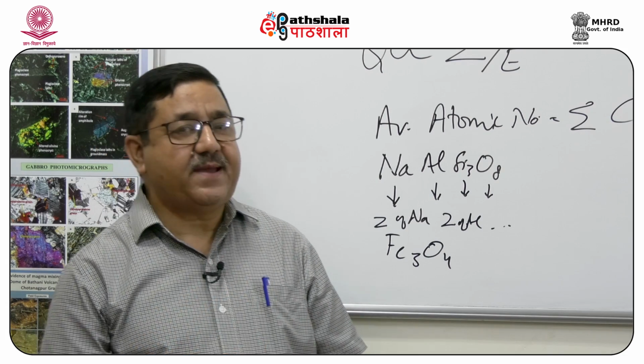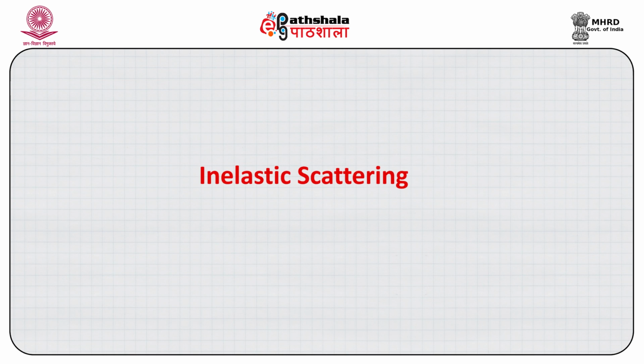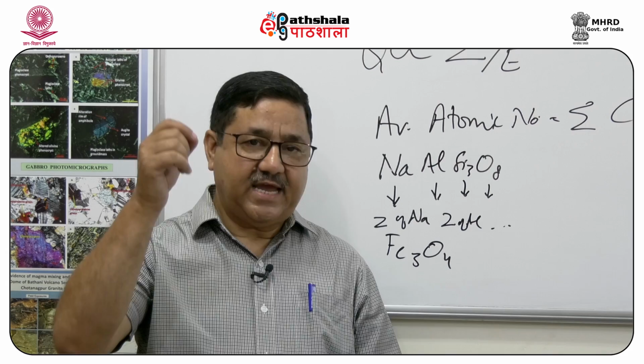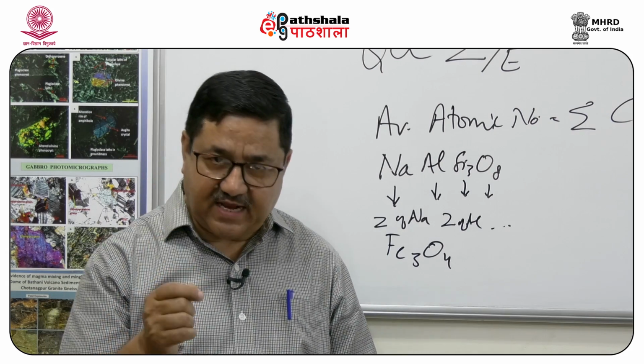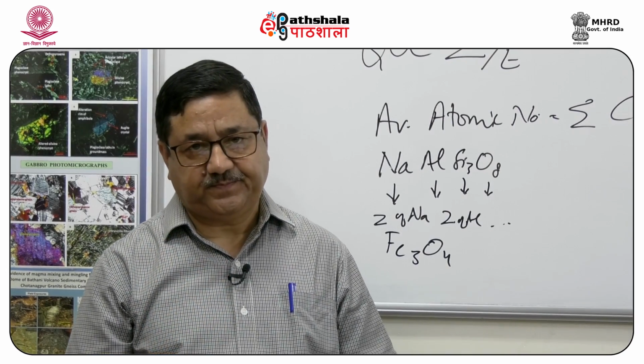The other thing which happens is the inelastic scattering. Now, inelastic scattering occurs because an incident electron beam passes through several events till such time it loses all its energy.